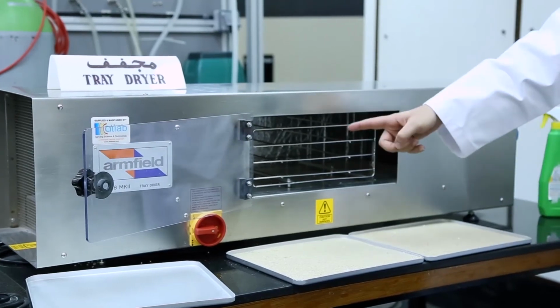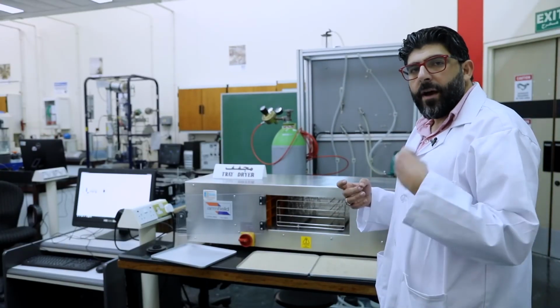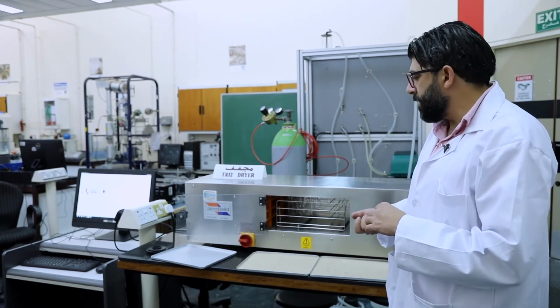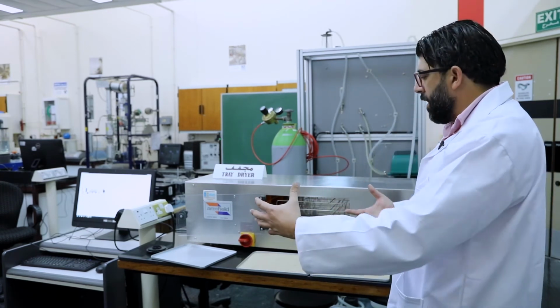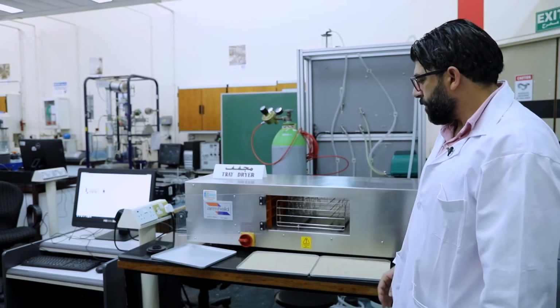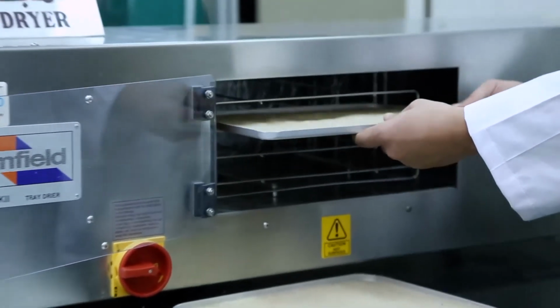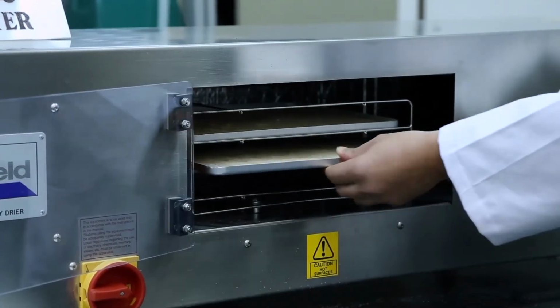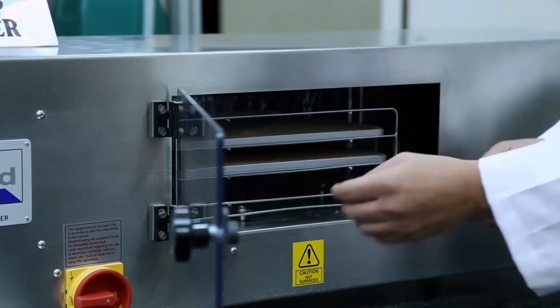Also here we have probes. You can see the probe before and the probe after. The probe before measures the relative humidity and the temperature pre the tray, and the other one is post the tray. Also we have this orange one, which is just to distribute the air among the trays. So just to see, we can put the trays here and close. This is what we will do later. Okay, I will remove it again.